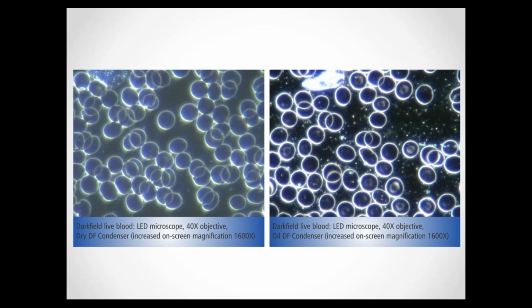Some of the so-called dark field microscopes have a 30-watt lamp, but even these are still not suitable and bright enough for dark field. To be able to see the structures that you want to see in dark field, you need at least a 50-watt halogen lamp. This will produce enough brightness to illuminate those small and fine structures between the cells. Anything less than 50 watt will not produce enough brightness, and you'll essentially see what you saw in bright field, but only against a dark background.